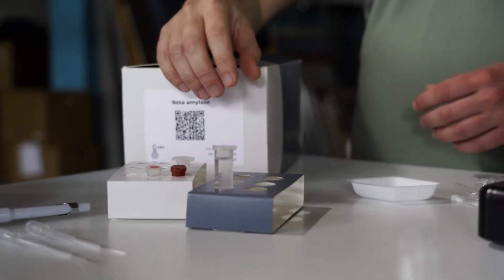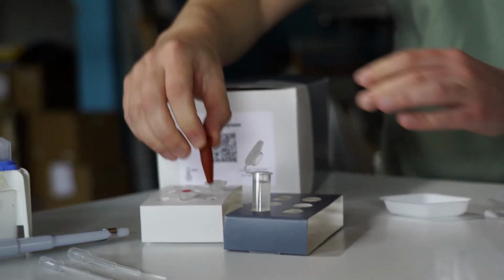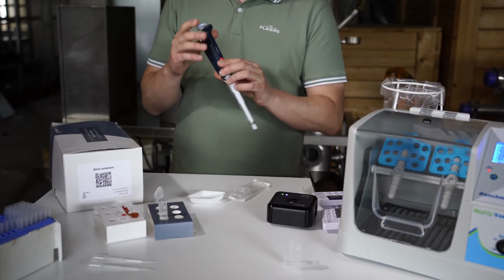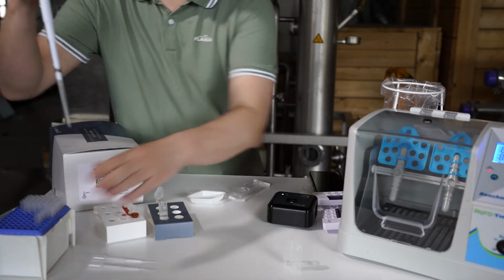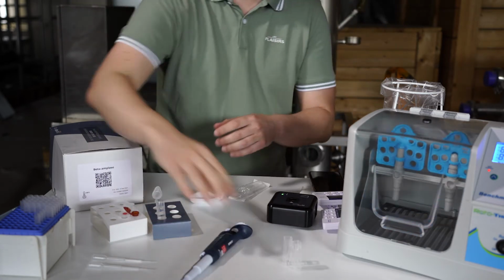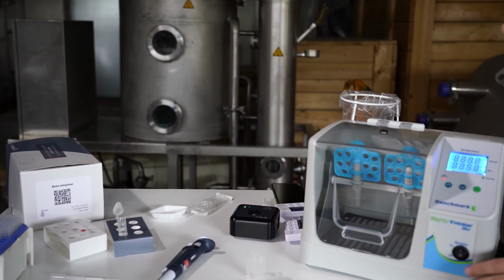So we can place the tube here in a support that we give in the kit, and what we need to do is to pipette 250 microliters from this tube to the substrate tube. You just need a regular 250 microliters pipette, or a pipette that can measure that volume, and then you would just go ahead and pipette this volume from the filtrate to the substrate, and as quick as you can, mix it, and place it in the heated incubator.